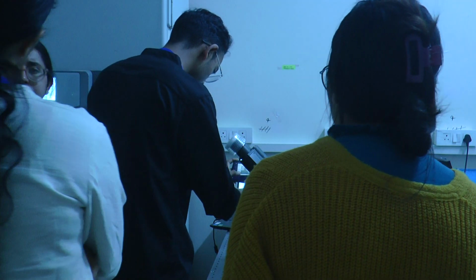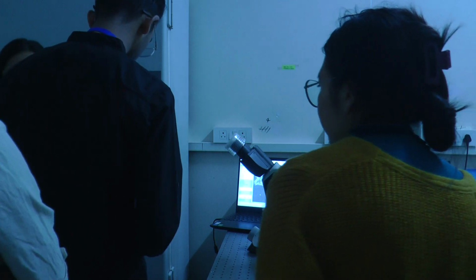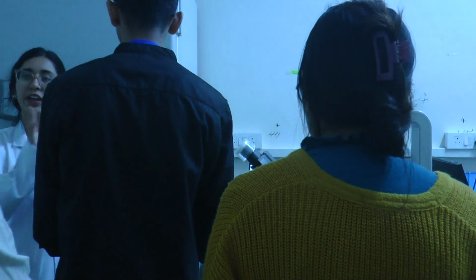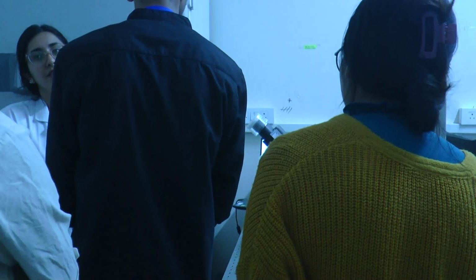You need a dye for that. For confocal I need a dye, and for that I can use Nile red. It is a membrane dye, so it goes wherever there is membrane. But we have to be careful because these cells also have a lot of lipid, so we have to separate them, because then the cells give a large intensity. If I visualize it, I will only be able to see the cells. They will suppress the vesicles. So I just separate that out. We can just take the solution from that.